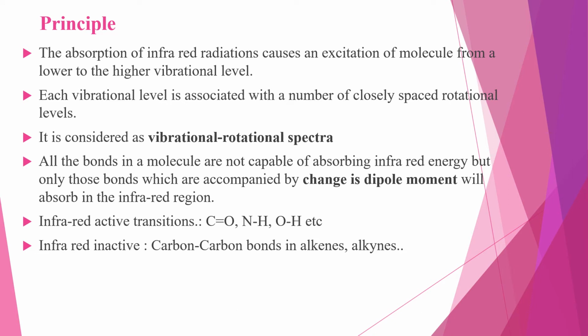The absorption of infrared radiation causes an excitation of a molecule from a lower to a higher vibrational level. We know that each vibrational level is associated with a number of closely spaced rotational levels. So, the infrared spectrum is considered as a vibrational-rotational spectrum.